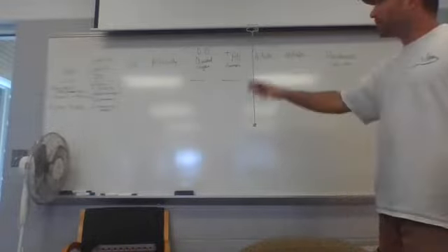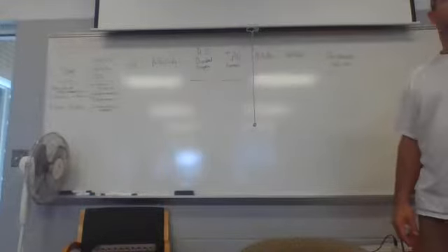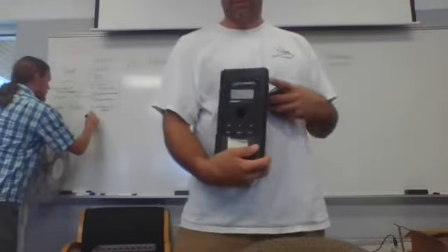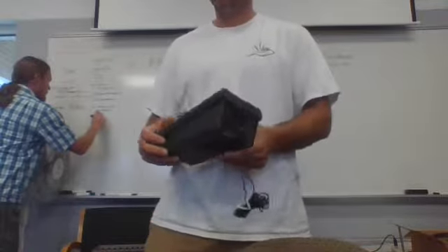All right. Any more ways to measure conductivity, salinity? You can use a spectrophotometer, can't you? All right. Excellent. What is a spectrophotometer? Those light waves. All right. This is a smallish spectrophotometer. We have some actually really big ones out in the other room as well.